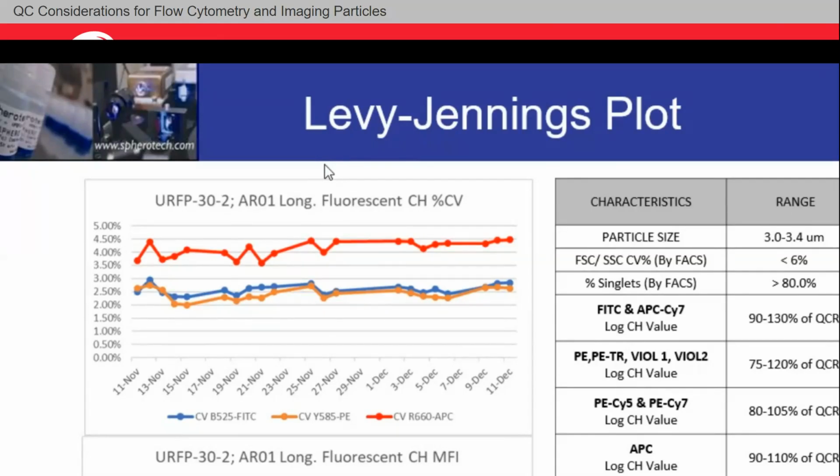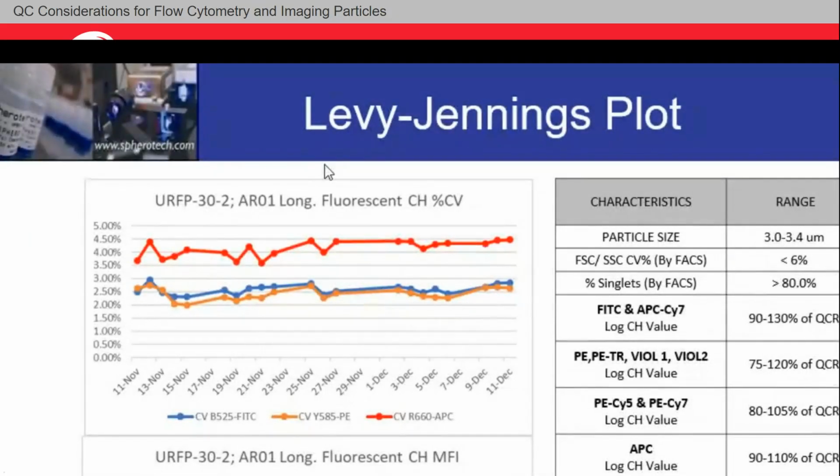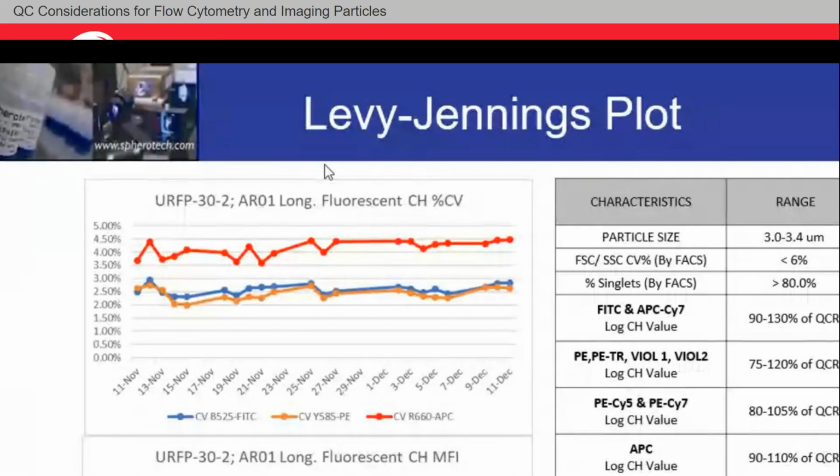There's something when you're starting to get low, when you're thinking you might get low, ordering that new lot, seeing if they're the same, asking me or one of our other tech support representatives, hey, is this the same master lot? Is this a different master lot? This will come into play a little bit more when we're talking about calibration than with alignment. But these are the kind of questions, these are the kind of answers that you might be seeking.